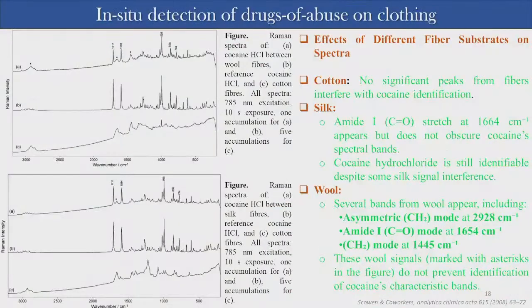Because this will be used for a real purpose. If you say that this lab can detect the drug in a crime scene, then police will come with a sample, say a woolen sample. If you have not studied previously, if you do not have a database, then you cannot accept the sample. You cannot use a woolen sample when you have just a data set for the cotton one, because you are going to help police in convicting somebody.